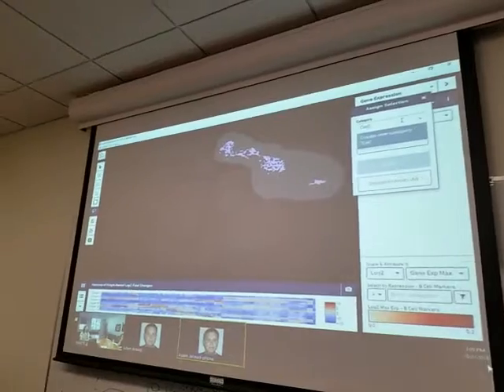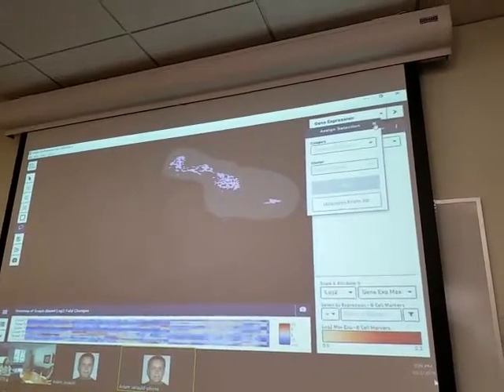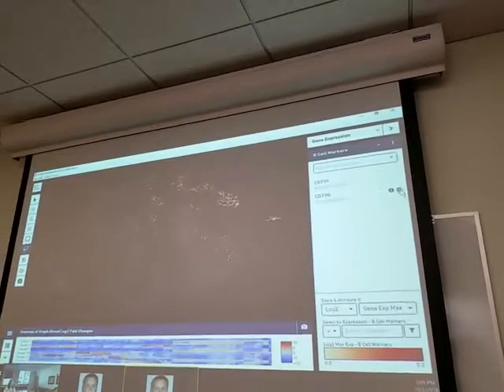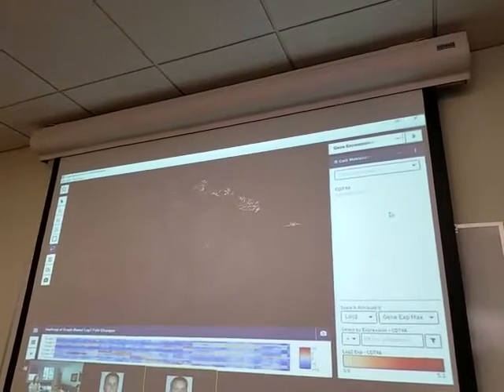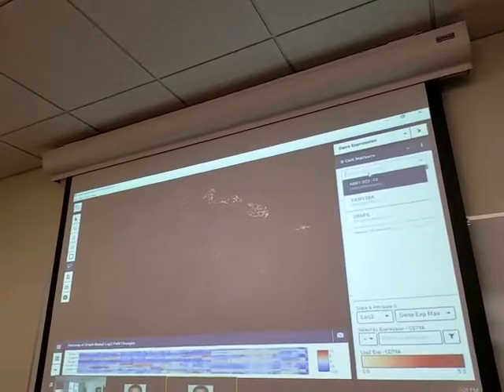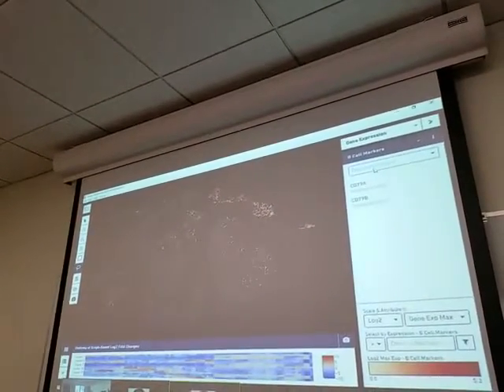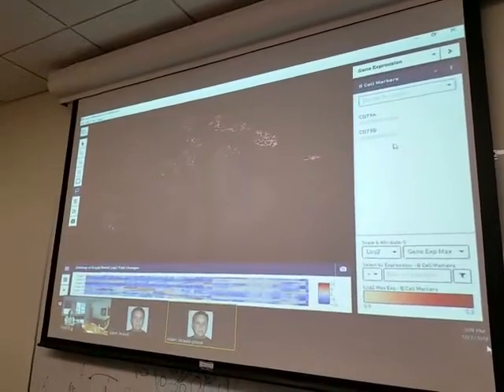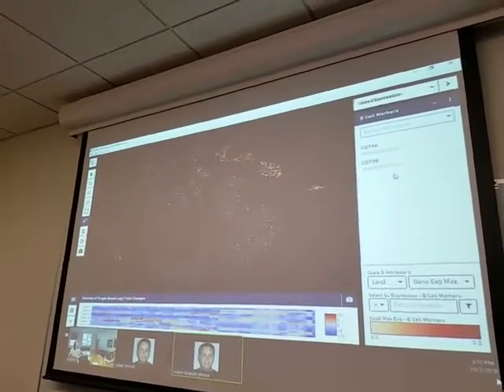And do you have both? Is that CD79? Just a question, because I can only do one at a time. Is that 79A and B? You could. So why don't I drop one? Oh, I see, just an alpha. If you put two there, then it does both. Is that right? Because what we do, we put one there and we have to touch it and highlight it. So now you're saying maybe we don't have the latest version. So you can put as many genes as you want over there and it'll highlight whatever.